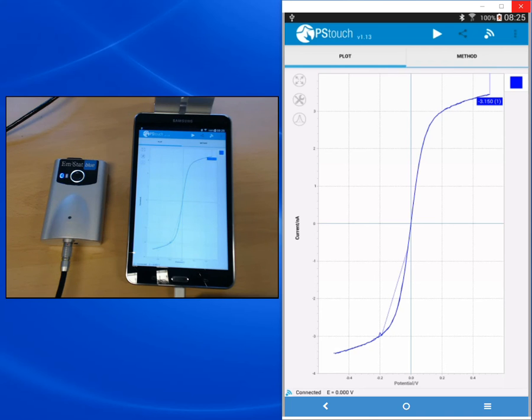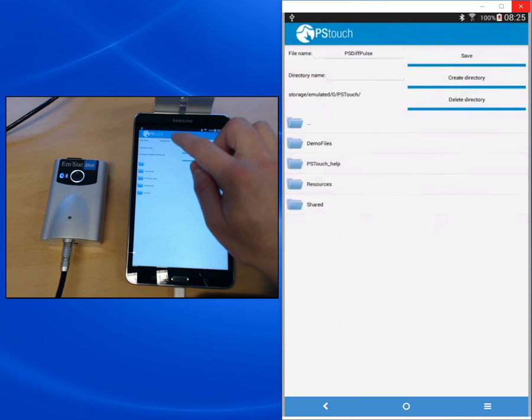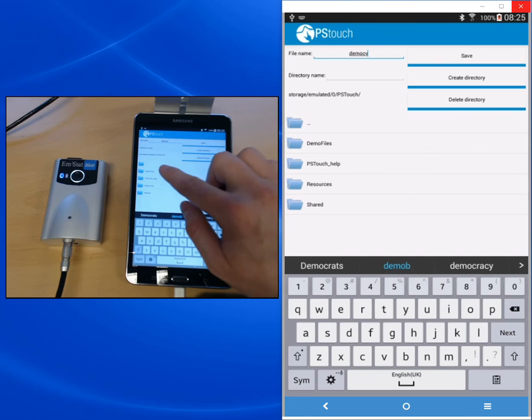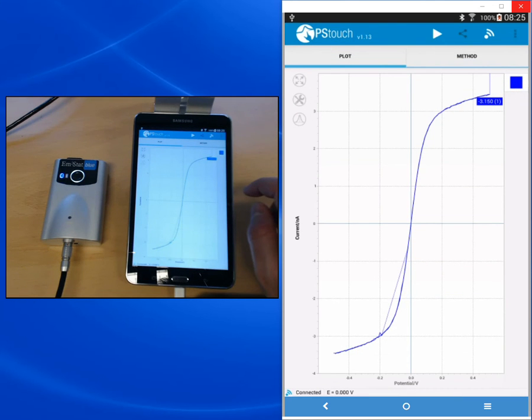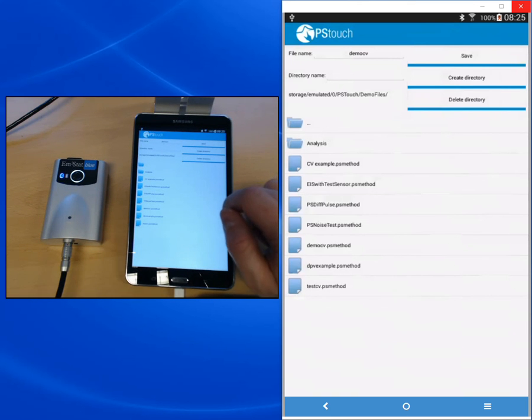After you've finished your measurement, you might want to save it. Press the menu button on the top right and choose Save Curve. You choose a file name — in our case 'DemoCV' — and choose a directory for your file. Press Save and you get the message that your curve is saved. If you want to use a method multiple times, you can also save the parameters by pressing Save Method. However, every time you save a curve, a method file with the same name is automatically created, so it's not necessary to do that separately.